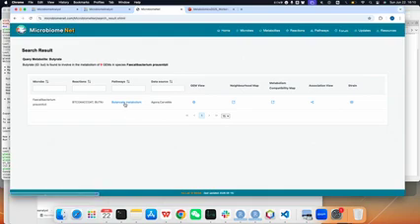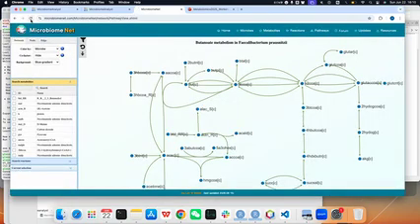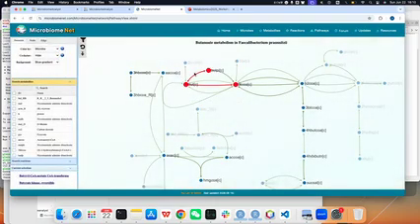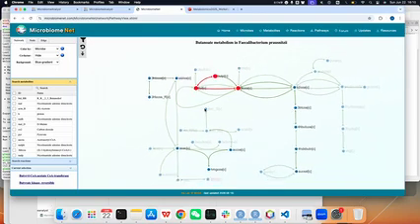And in this pathway, maybe we can click here to see, maybe refresh. So this is how we highlight the reactions that metabolize the specific metabolites. So this is this pathway in the species we are interested in. So this is the first question.